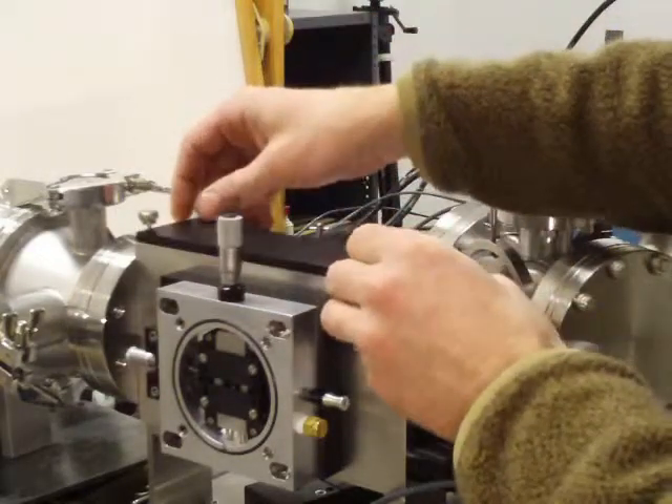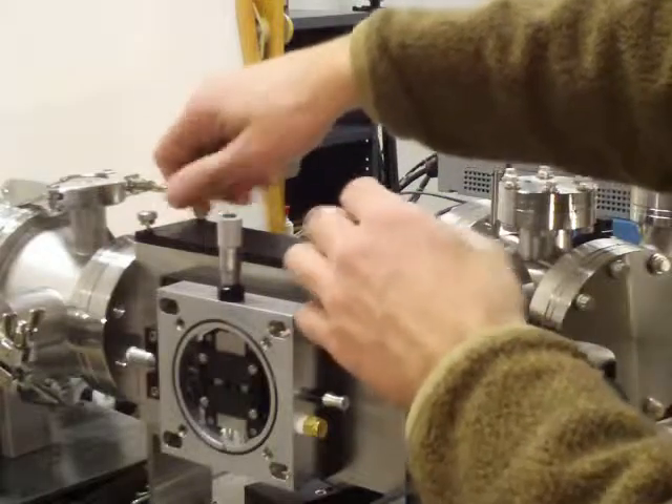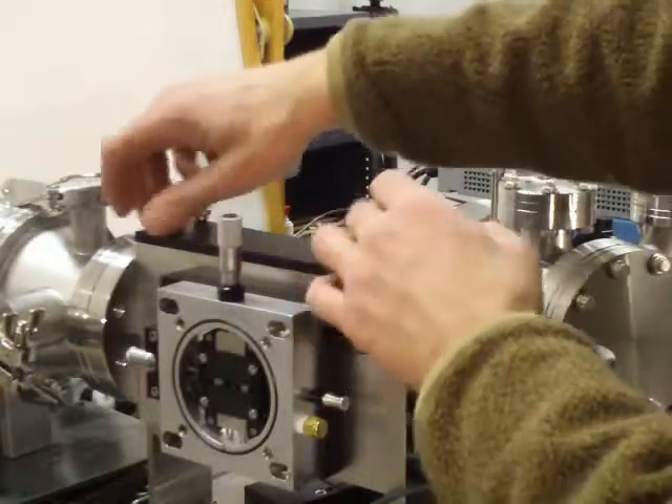We can close the cover again. If we were pumping today, we could pump down already. That's as simple as it is.